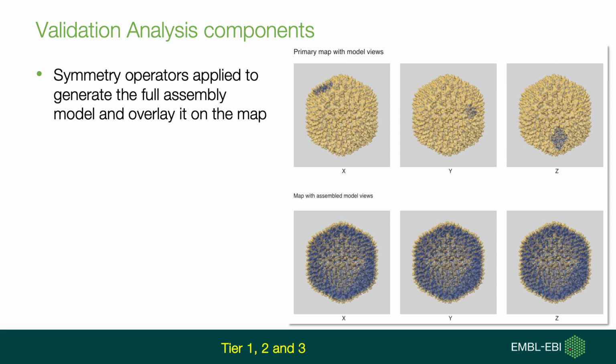A much requested feature is to show how the model fits in the map, not just for the asymmetric unit of a virus, but also to show how the entire model of the virus fits inside the map. So that's been implemented also in all three.